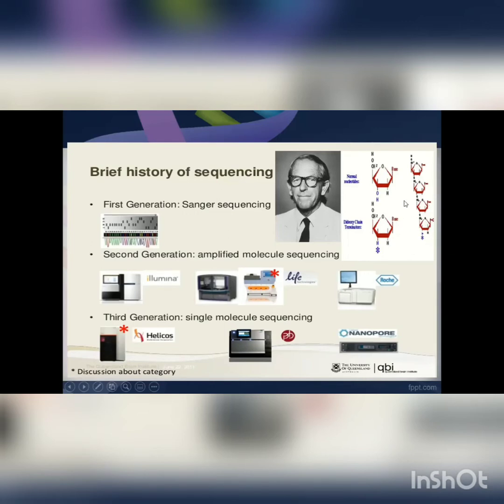That is only possible with the normal nucleotides, which have the OH group at this position. Though Sanger sequencing has been replaced by next-gen sequencing methods, especially for large-scale genome analysis, it remains in wide use for smaller scale projects and also for the validation of next-gen results.